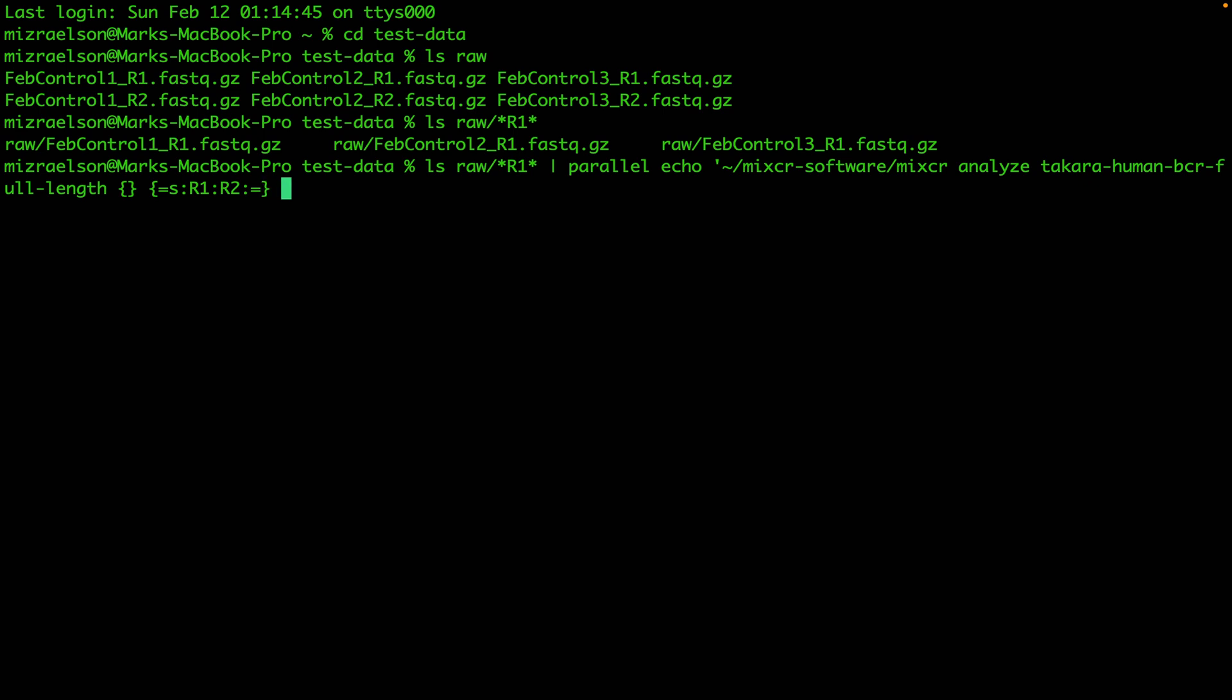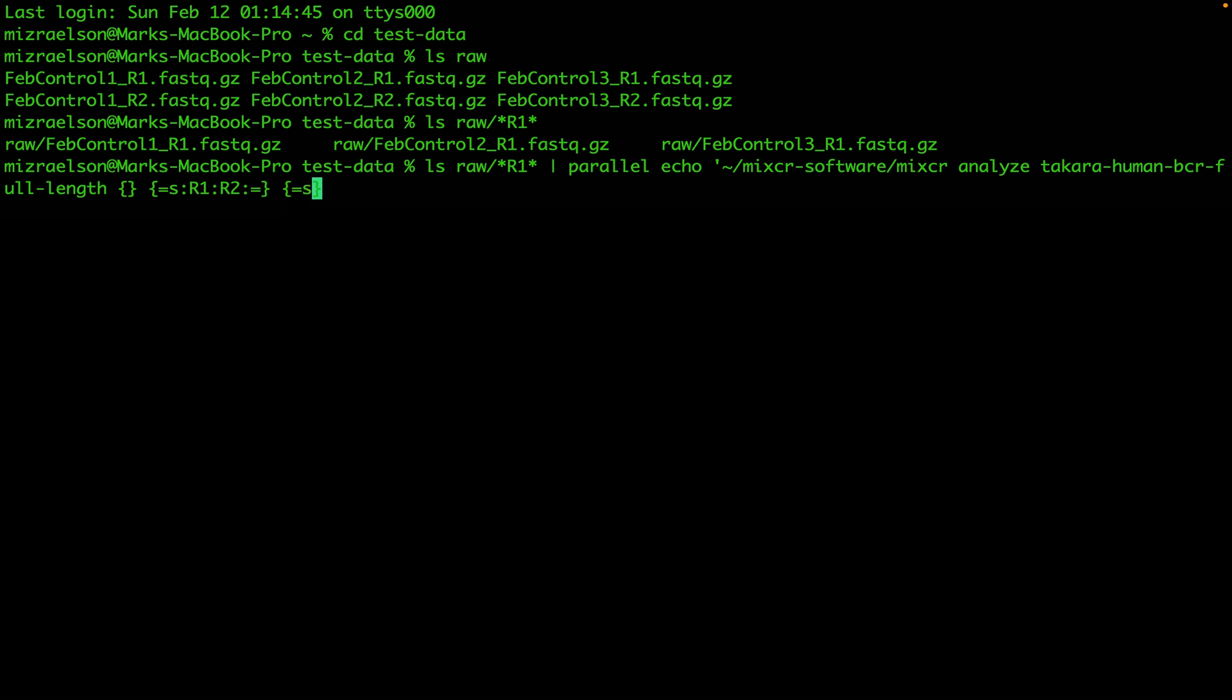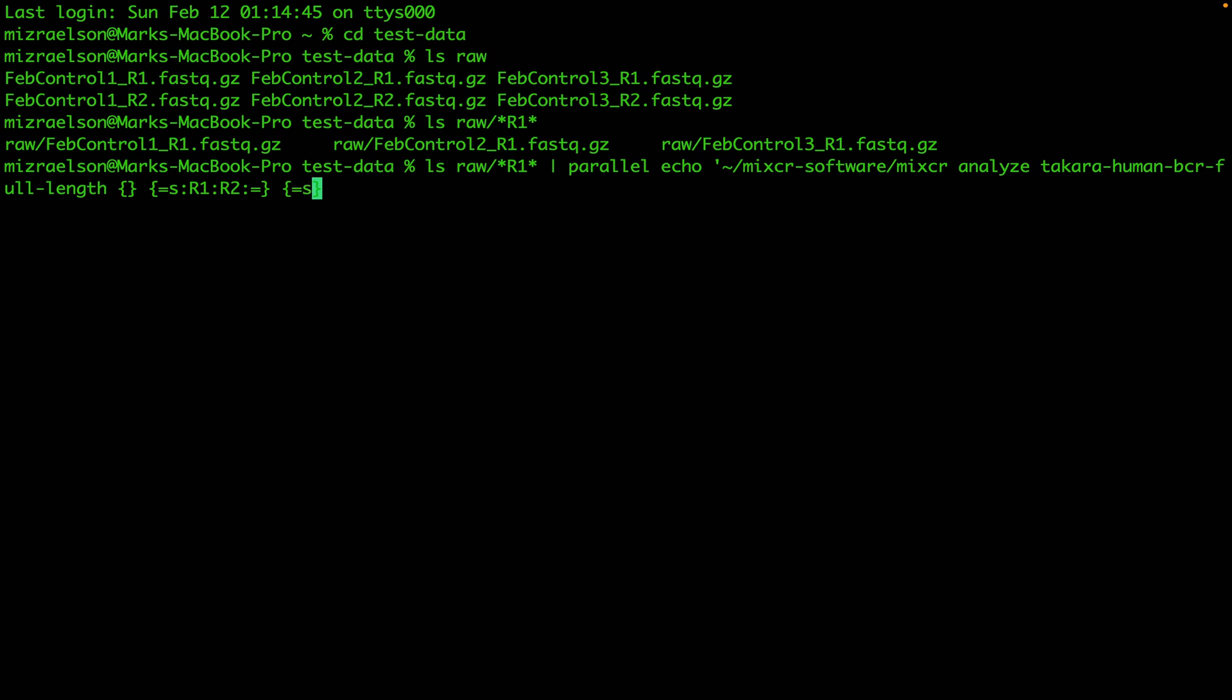Finally we have to provide the output directory and the output prefix. Again we're going to use the same curly brackets and we're going to substitute the raw folder with the results folder.